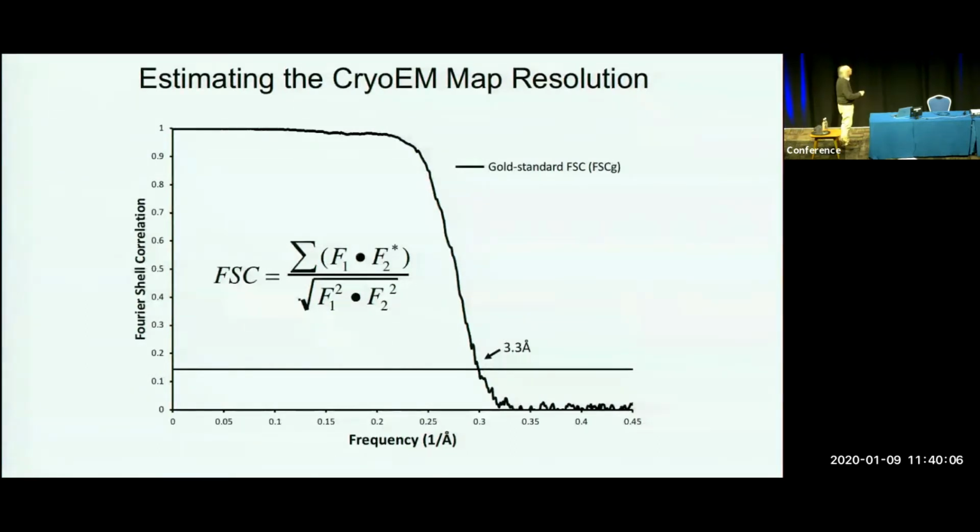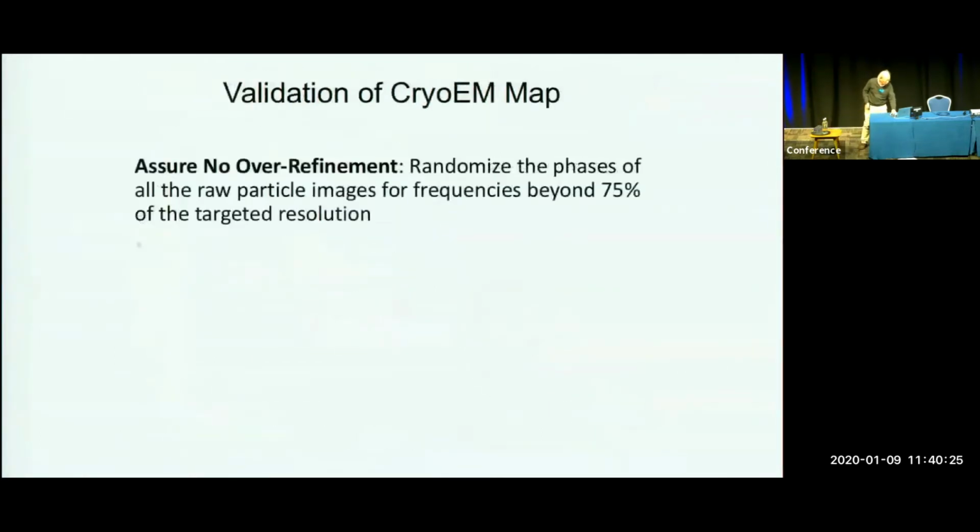It turned out that when we do the image processing, and we haven't talked about this in the last couple of days, there are many ways of doing it. You can keep refining in such a way that you push your curve toward the right-hand side, because you always want to get better numbers. That is very dangerous. So one thing we have agreed on is that we don't want to refine our map just to make our numbers look good.